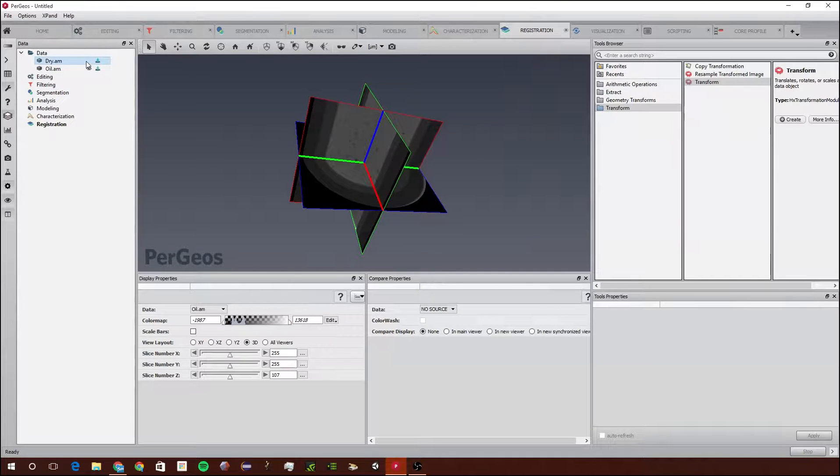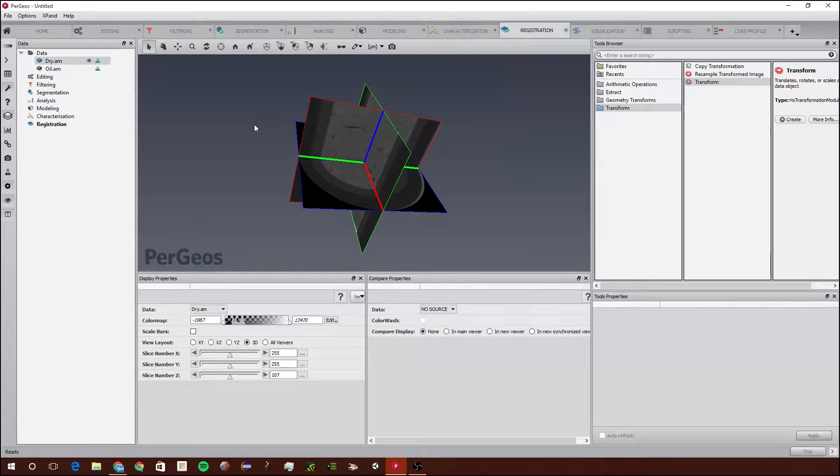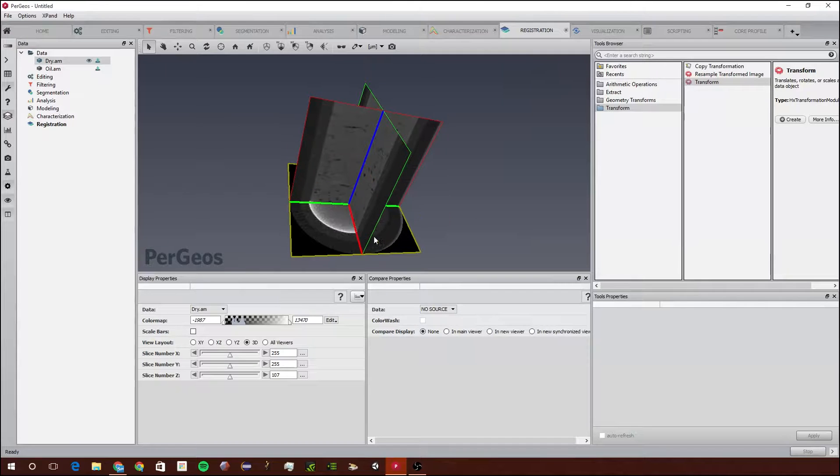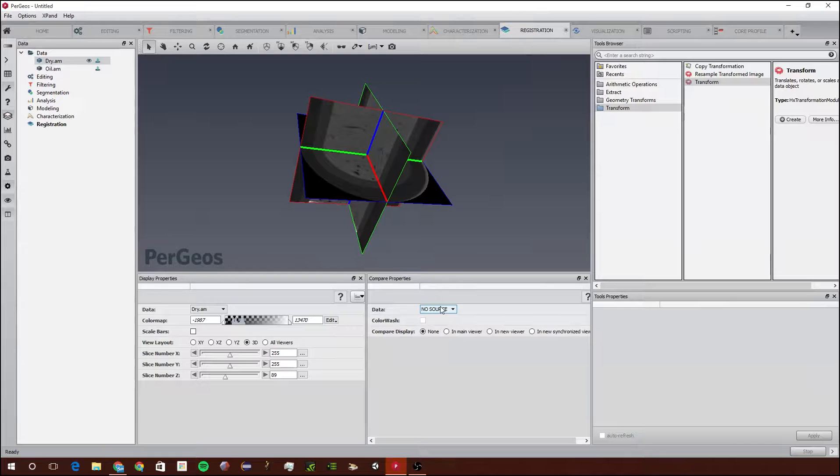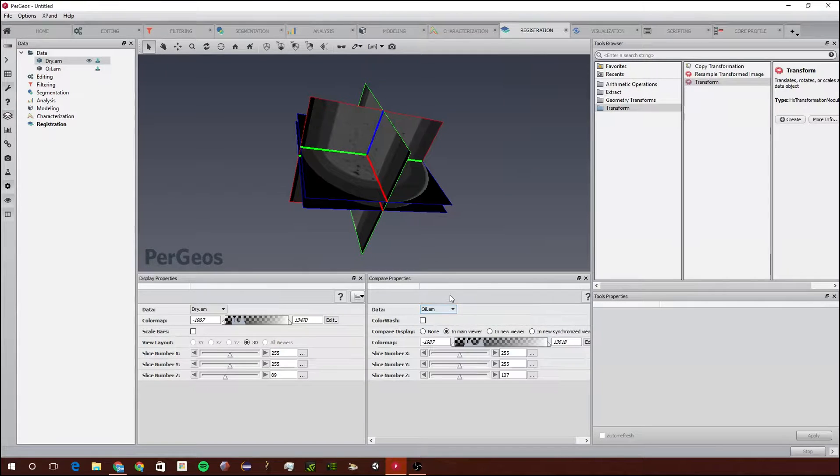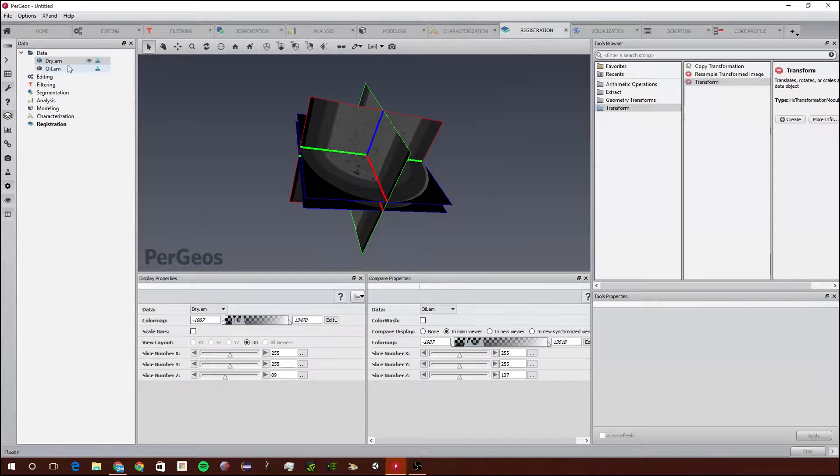We're going to double click on Dry to make sure this little eye is displayed. Now that we're in the registration workspace, we're going to go to Data and oil.am. This will display the other image that we want to register with the first one.